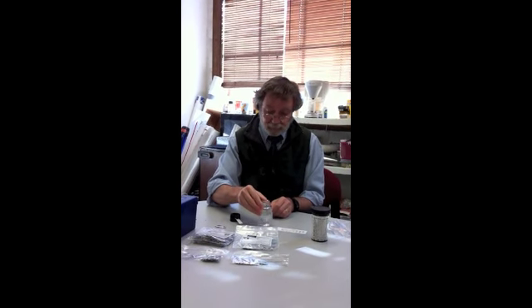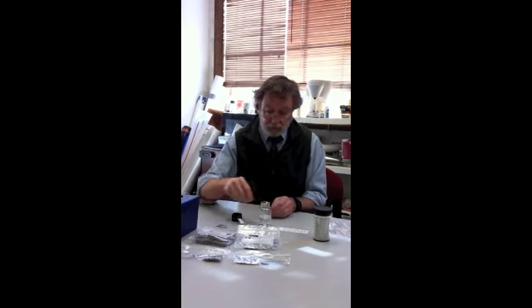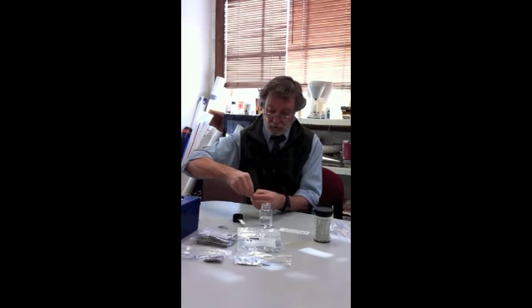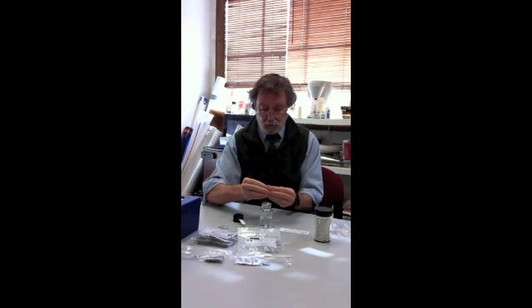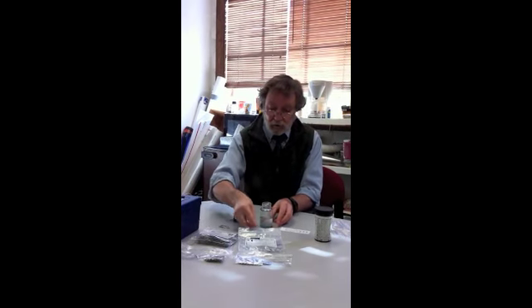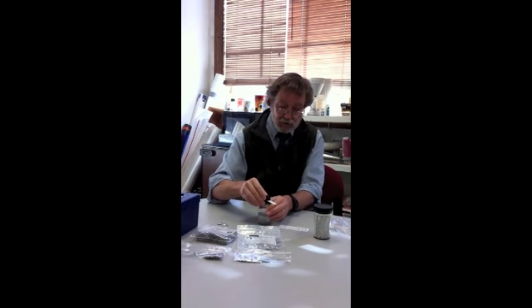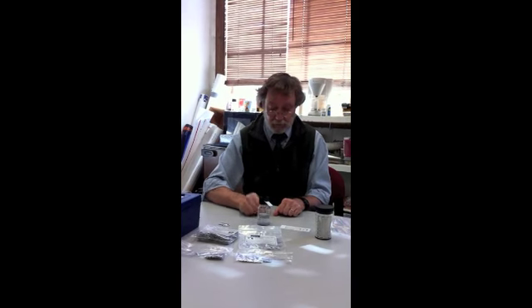So once the first reagent has dissolved completely, the next part of the measurement is to add the second reagent, which is powdered zinc. So again, tear off the top of the little pouch containing the reagent, and now add the contents of this to the solution, and then place the cap on here and tighten so that it's a good snug finger-tight fit to the top here.